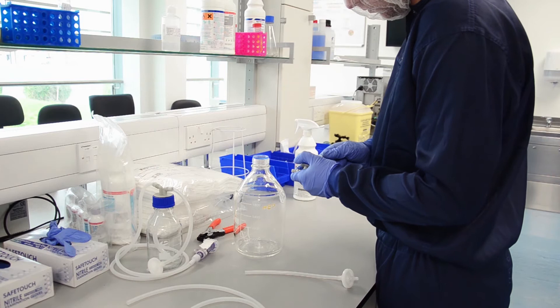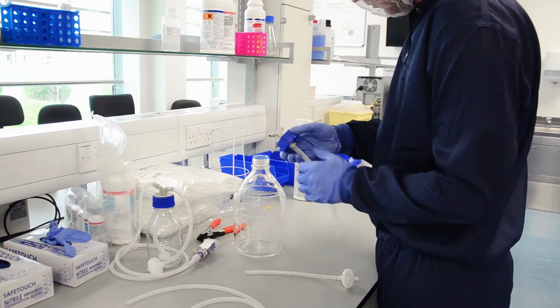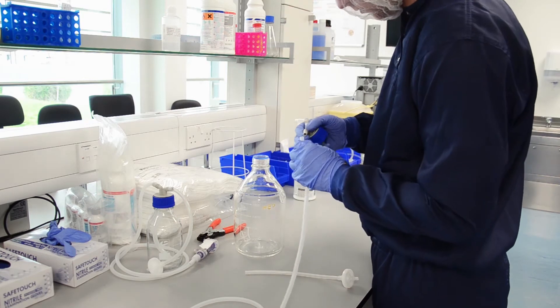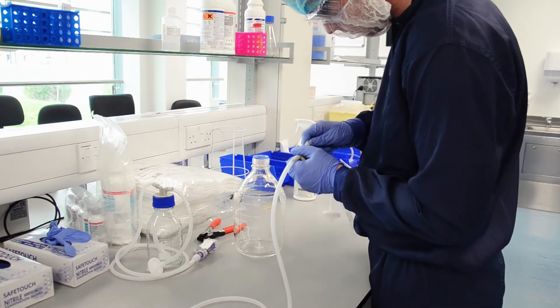Shown here is the media edition bottle being made up. A piece of tubing long enough to reach the bottom of the bottle is attached to the connector. The pipe that goes into the bottle has a V shape cut into it so it doesn't stick to the bottle while pumping.